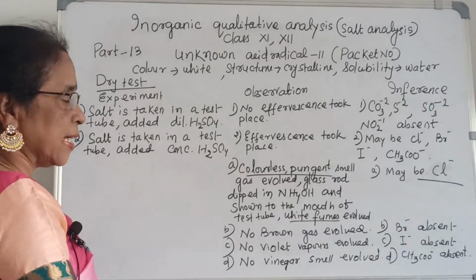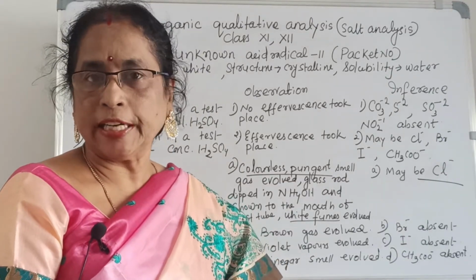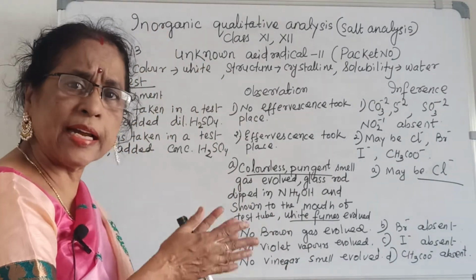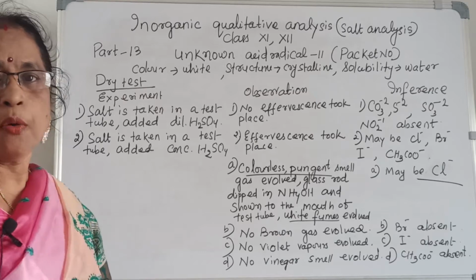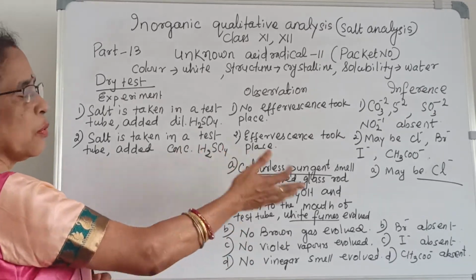After this dry test, I will go to the other test, the wet test, and also someone is there for dry test. I have to complete dry test first, then I will go to wet test, and after that we will see what the wet tests are, that is, the confirmed test of chloride.